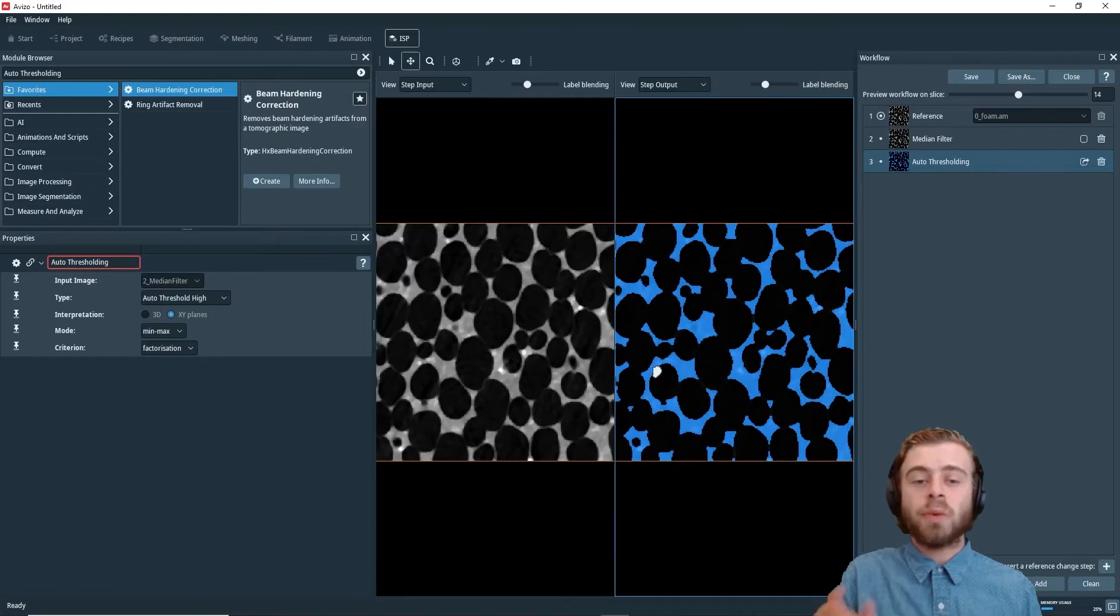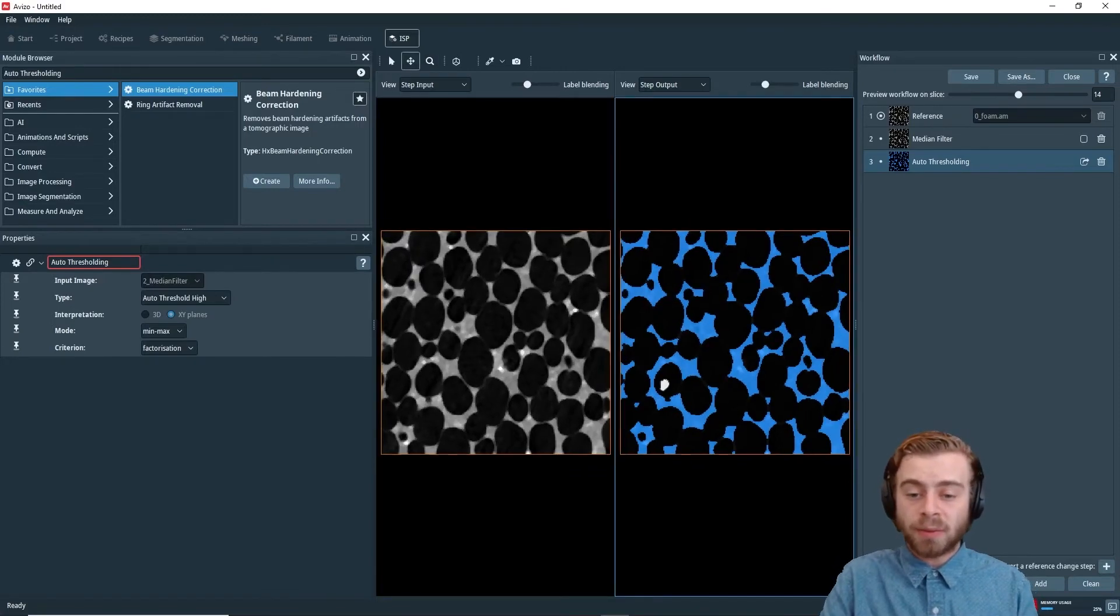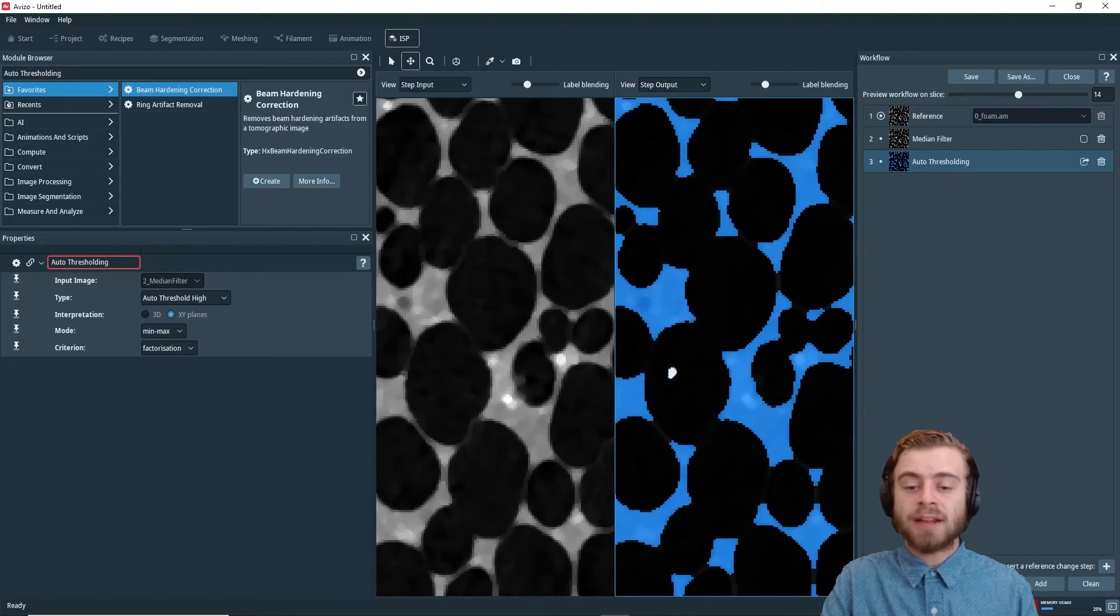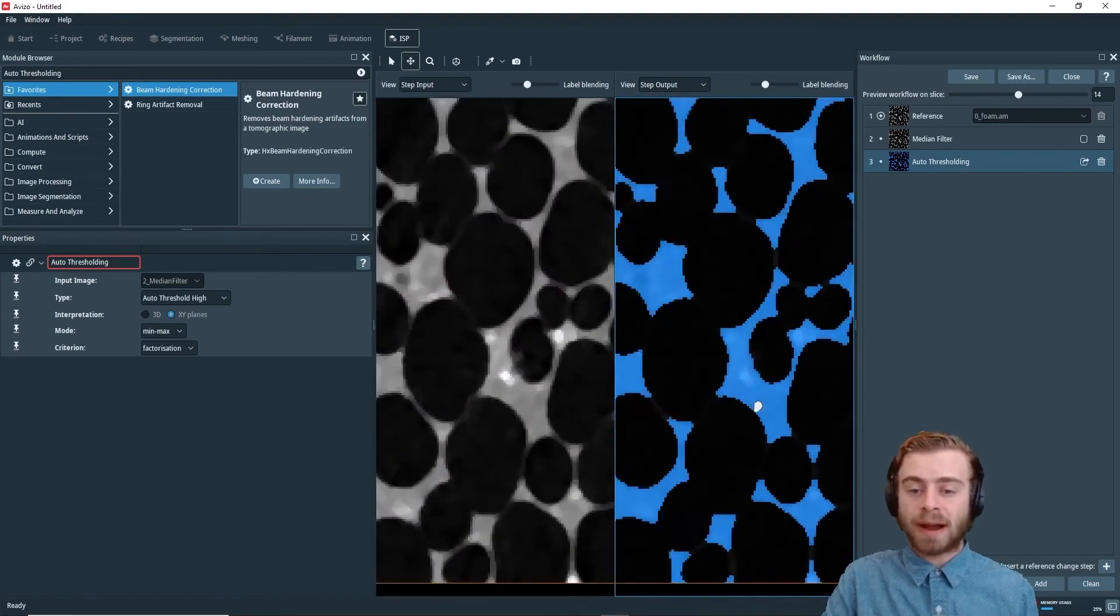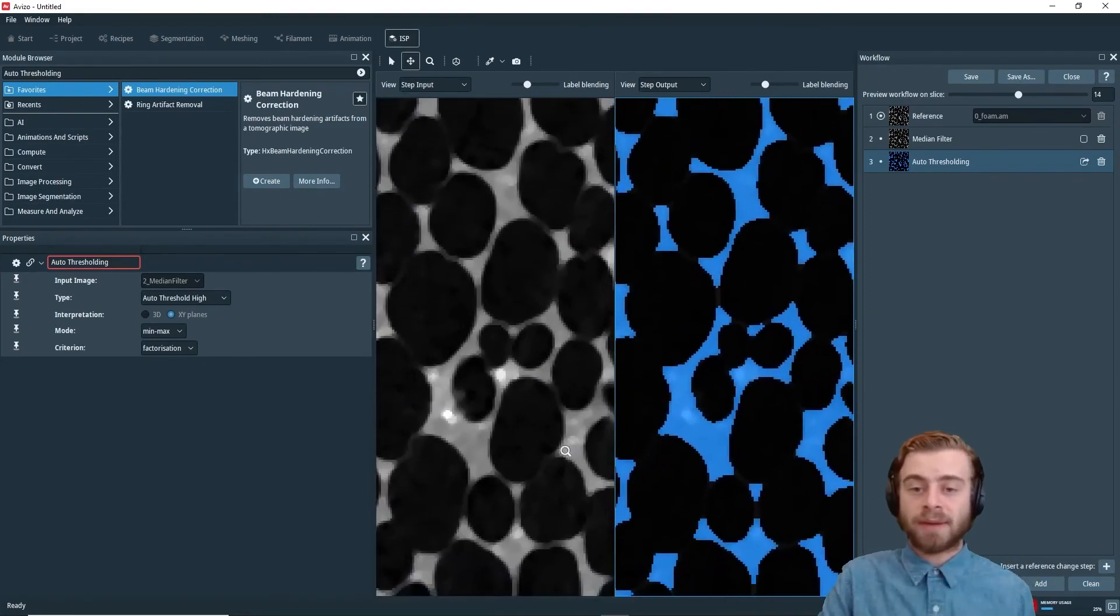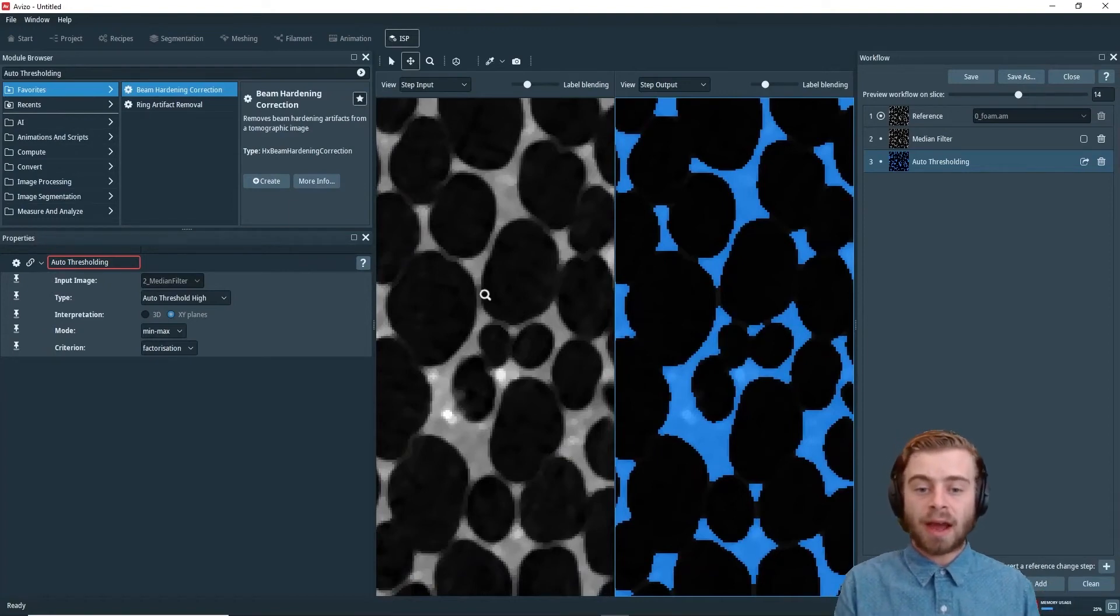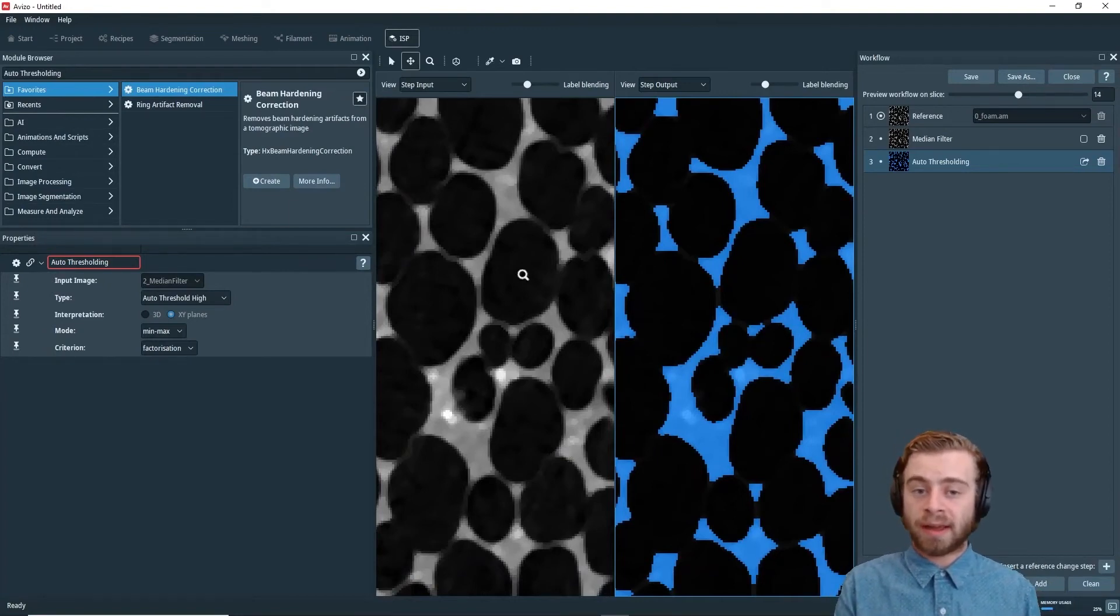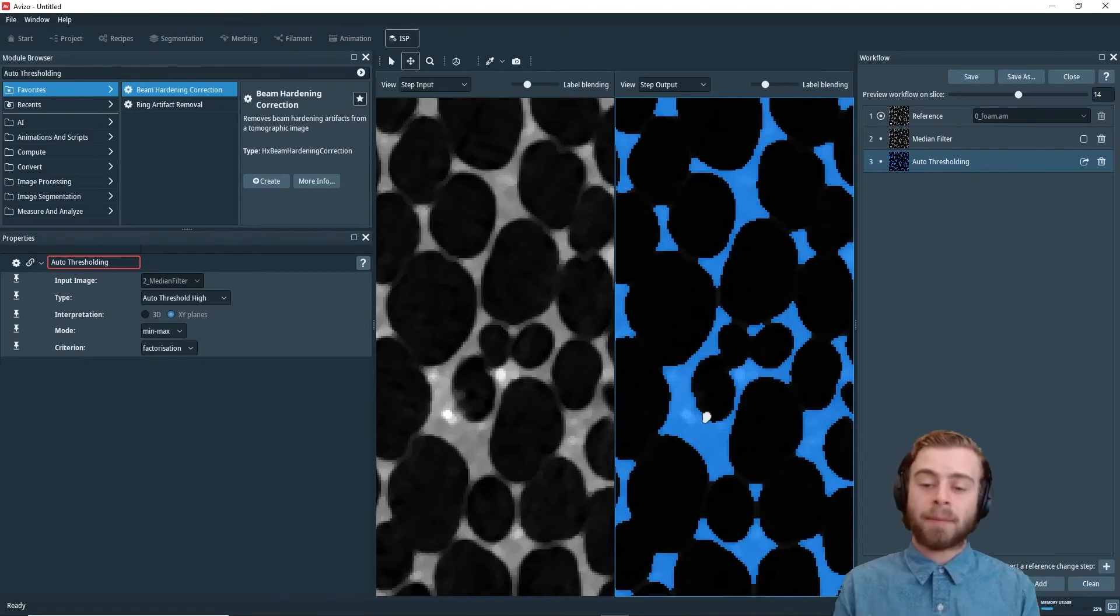So one thing that's really nice about the image stack processing workroom is when you zoom in on one image, it zooms in on both images. And when you move one image around, it also moves the other image around. This allows you to easily compare how something would look in the step input to how it turned out in the step output.